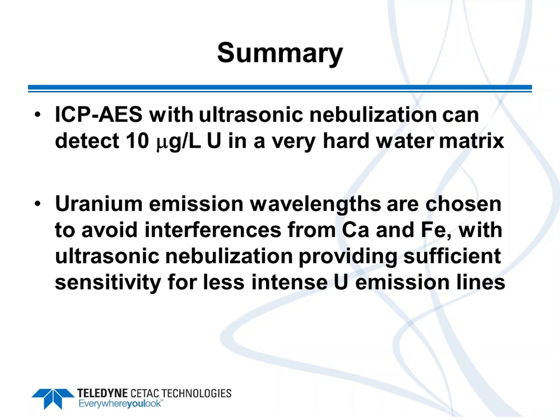Again, okay. Do you have ICP-MS data? Sorry, ICPMS. Yeah. The only ICPMS data we took here was with the standard nebulizer, just doing a check of the uranium in groundwater. Certainly, the ultrasonic nebulizer can be connected and has over the years to an ICPMS. Typically, then, you're looking more at elements above mass 80, things like rare earth elements and actinides, where you can push detection limits down very, very low.